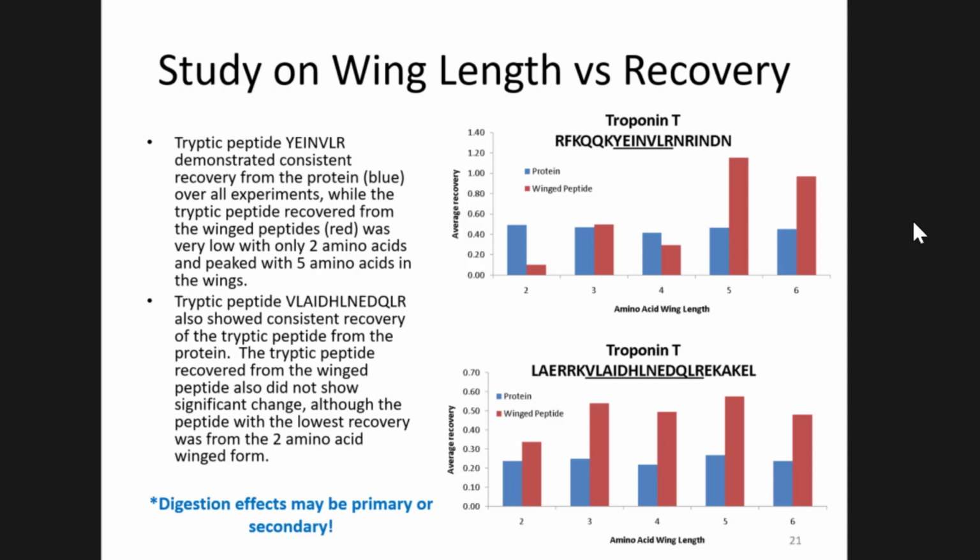So one of the problems here was we had this experiment repeated. 3 different individuals did the experiment, and each person got different results. And then I did it 3 times and got the same results each time, compared to the other people. At first we didn't know if it was solubility, these aren't mixing well, a sample handling kind of thing.